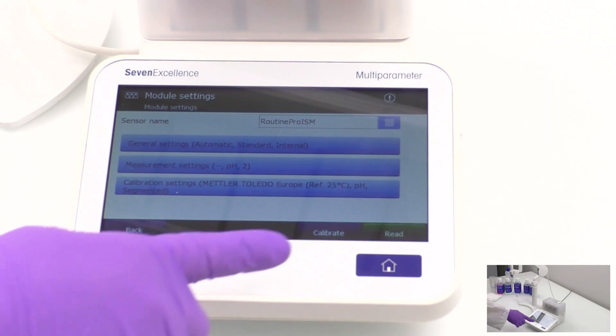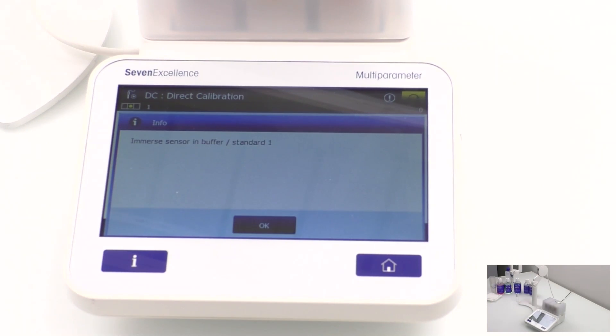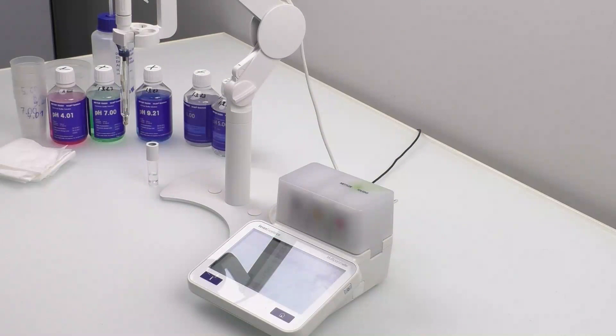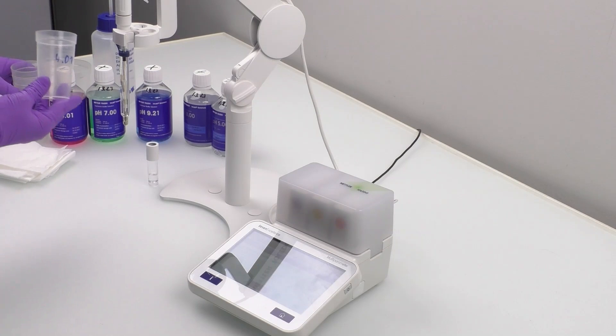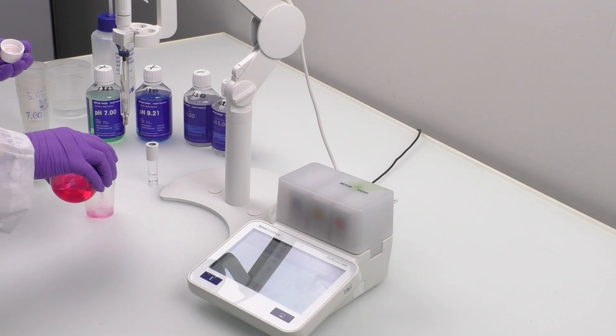Now, it's time to press calibrate to set the meter ready for the first standard. You will see a pop-up prompting you to immerse the sensor in the first standard. To start, prepare an aliquot of pH 4.01 in an empty and pre-labeled beaker. Pour about 40 milliliters into the beaker and close the bottle before setting it aside.